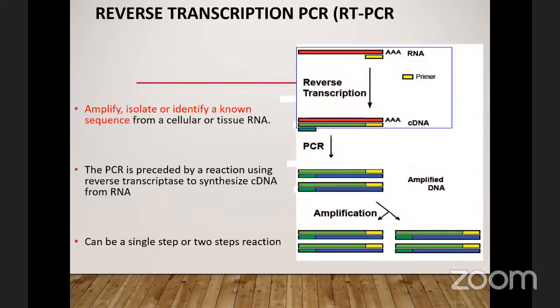So this next one is reverse transcriptase or reverse transcription polymerase chain reaction. Sorry, our time is far gone, so I have to just quickly run through most of these slides. When we are talking about reverse transcription, we know what transcription is, we know what translation is, right?